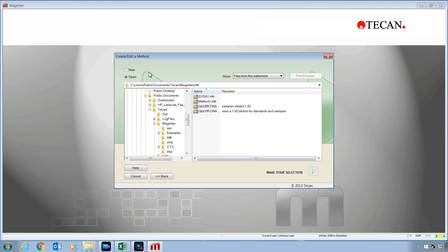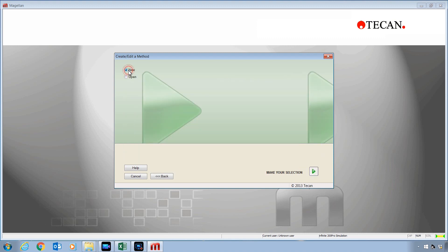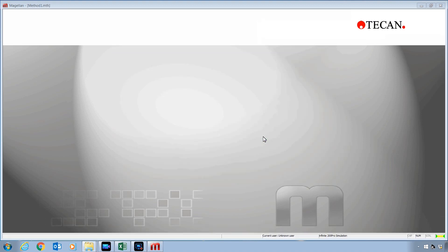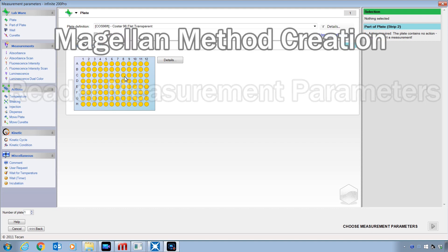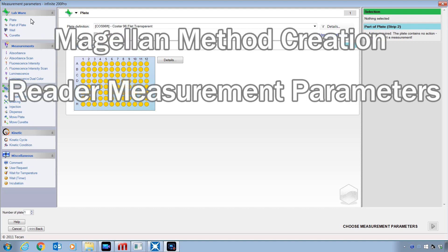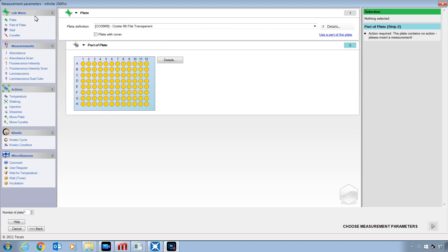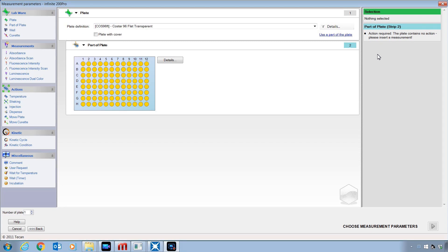Then select New and make your selection. This will bring us to the Magellan Method Creation Reader Measurement Parameters section. Down the left-hand side of this screen you will see all the various actions and steps that are capable with your instrument and in the central part of the screen is where you will order those steps. The right-hand side will be an info pane where warnings or other tips will be listed. I will not go into detail now about how to build out the measurement parameters.